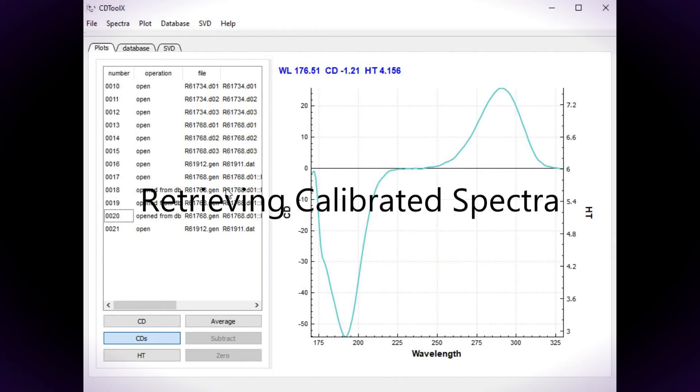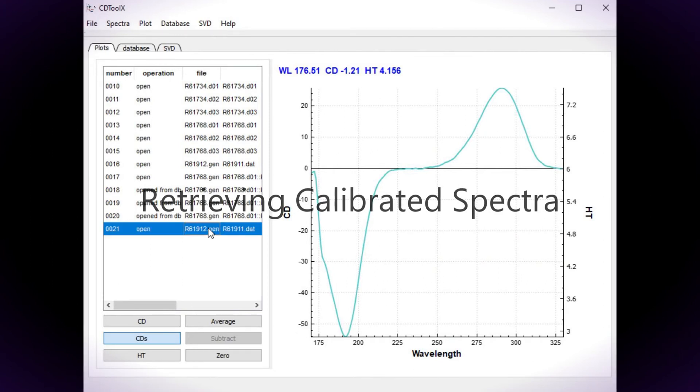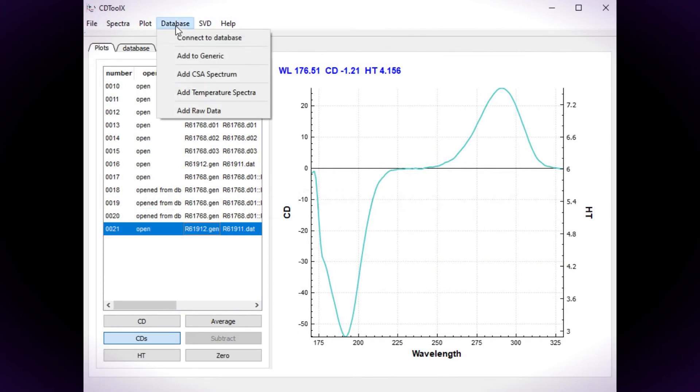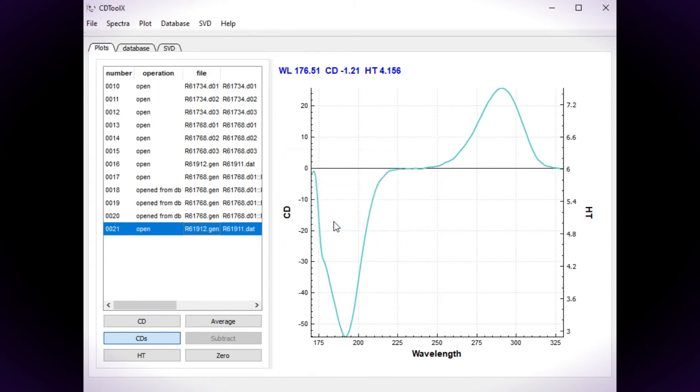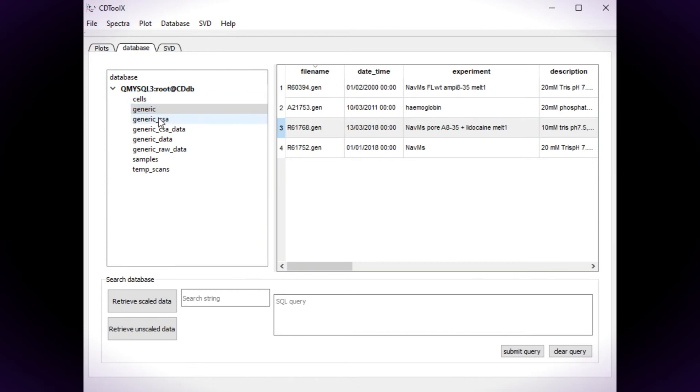If the instrument has been calibrated using CSA, the calibration spectrum can be added to the database by selecting it and choosing Add CSA Spectrum from the database menu.